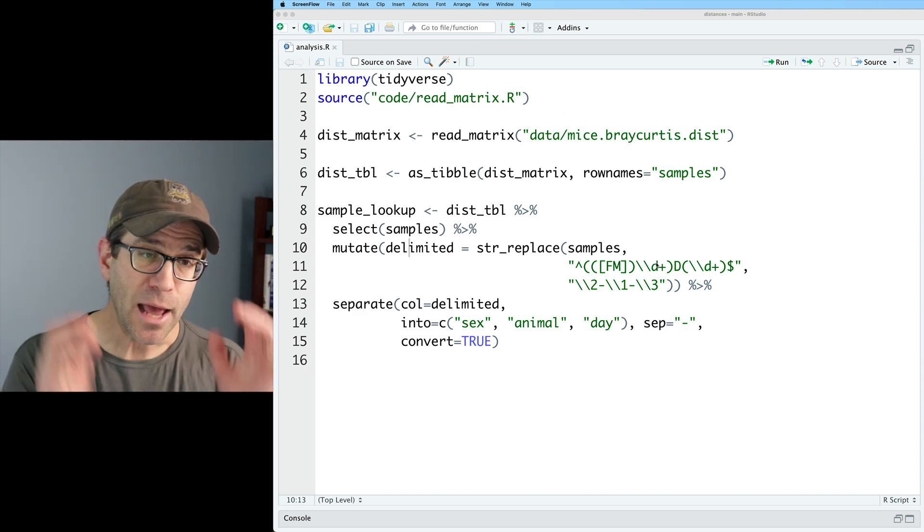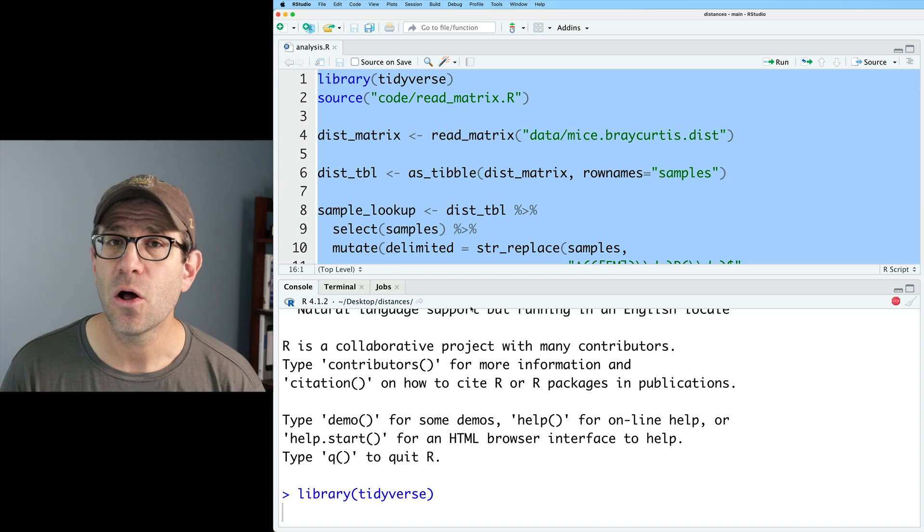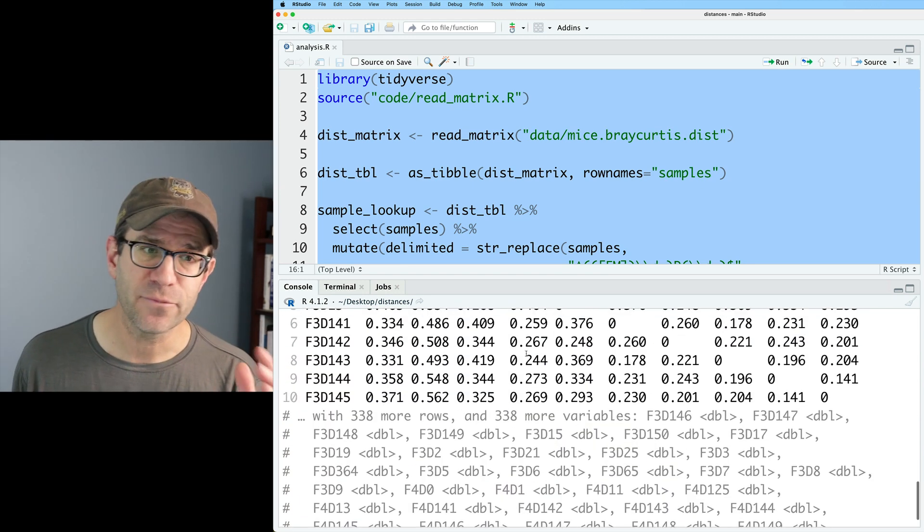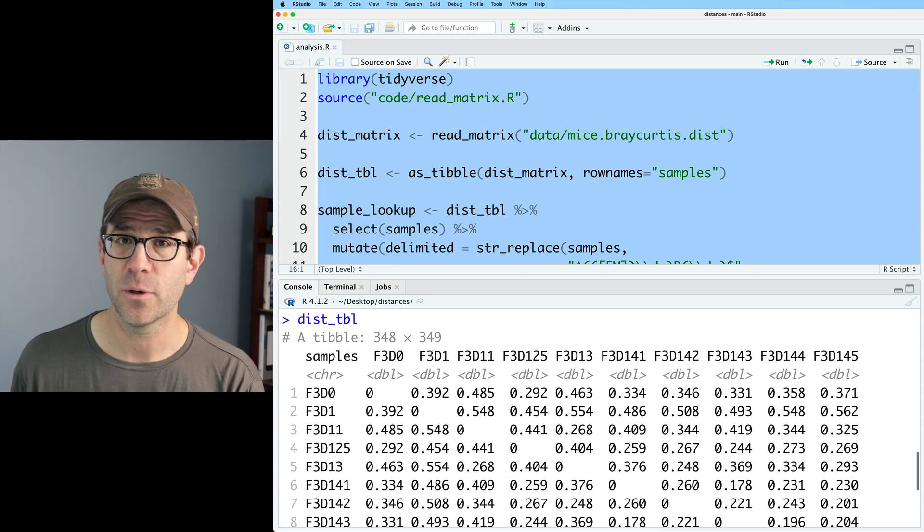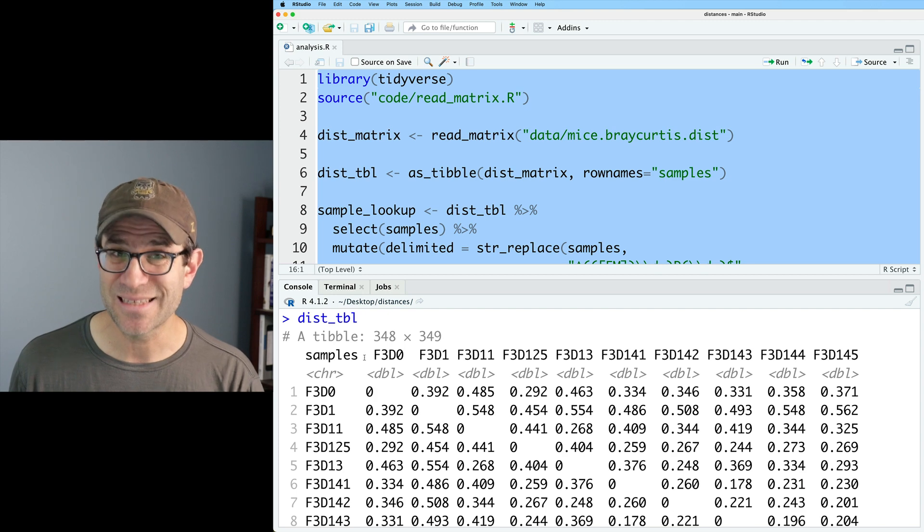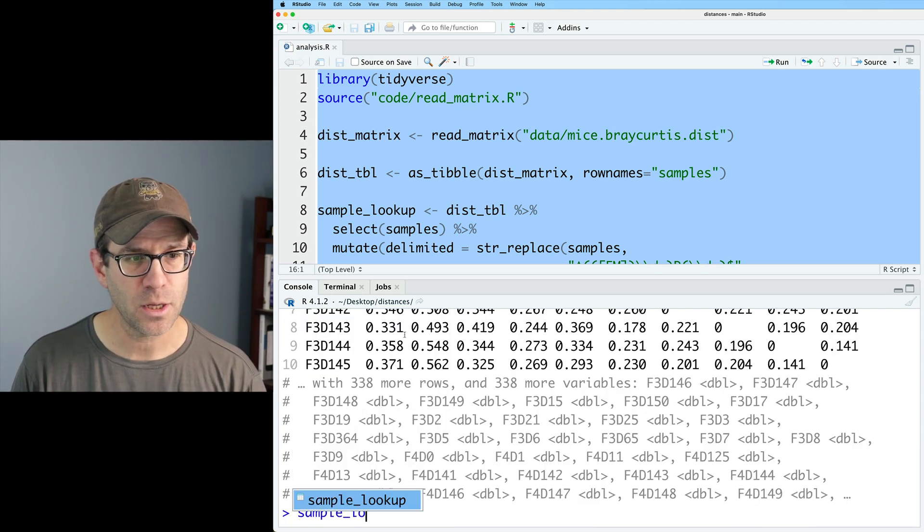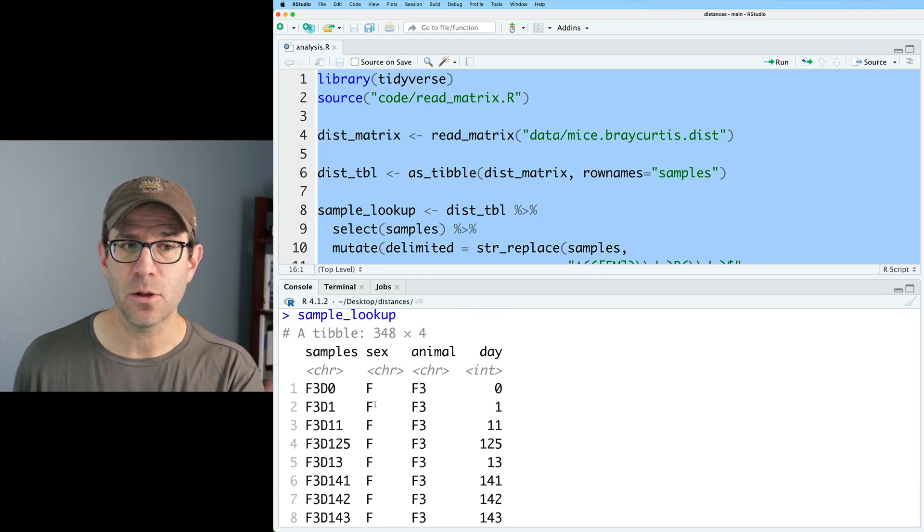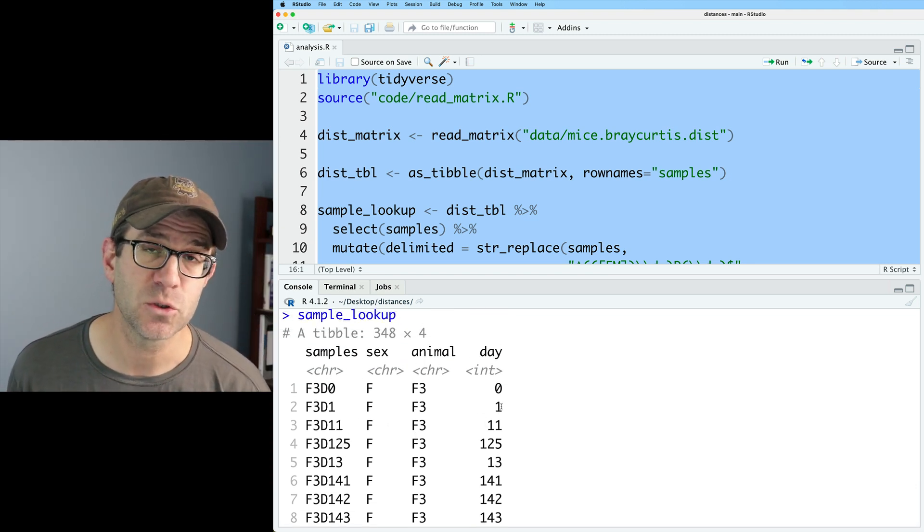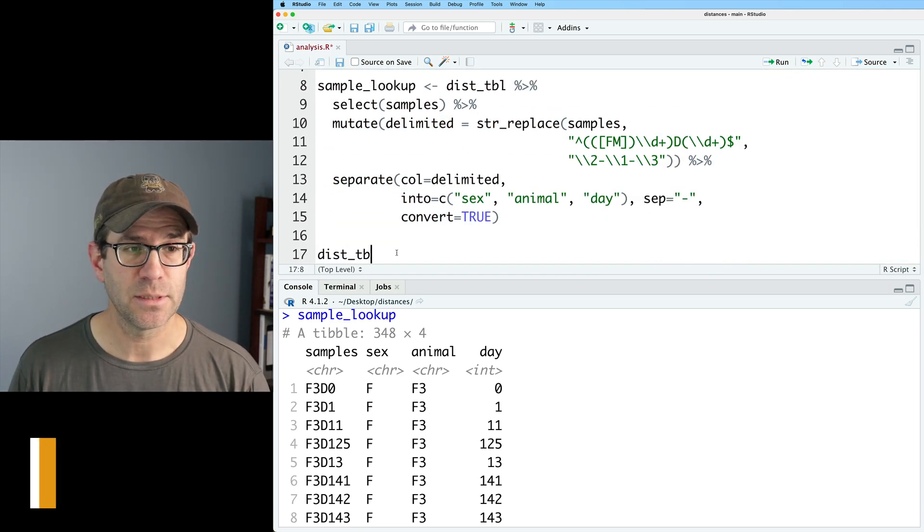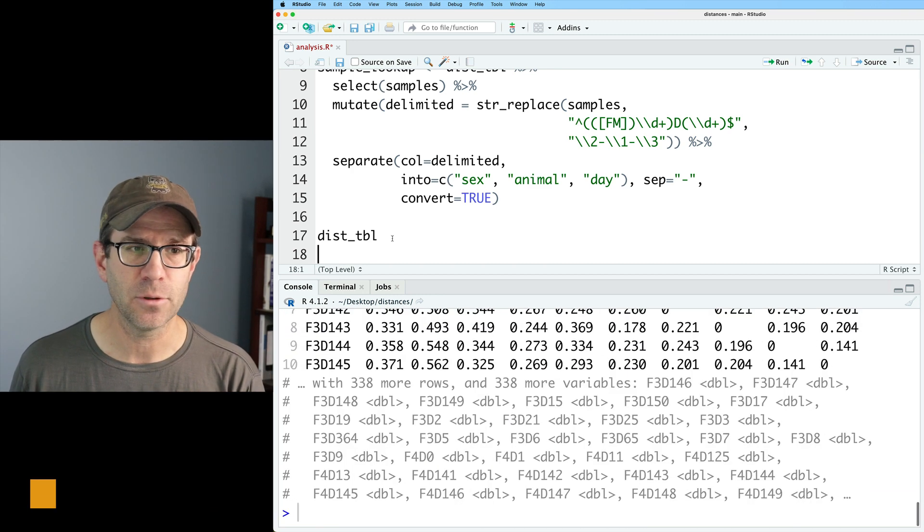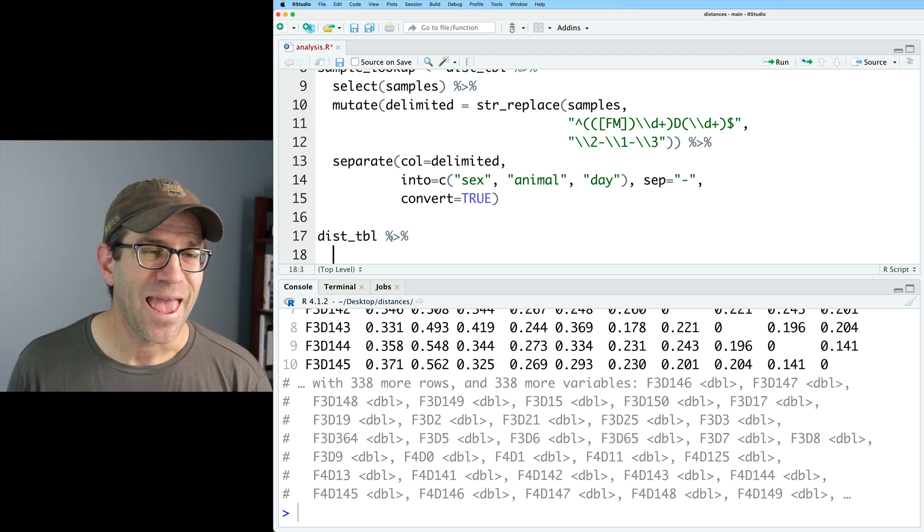So anyway, we have our R script here. I'll go ahead and run this and load all the code. So this will generate dist_tbl, which is a tibble form or data frame form of my distance matrix, 348 rows by 349 columns. It's got that extra column because it has that samples column. And if we do sample_lookup, we will then get a data frame that has the sample name along with the sex, the animal ID, and the number of days post weaning that the sample was collected from. So let's get started with this tbl. This is that 348 by 349 tbl. It's a special data frame in R that lives within the tidyverse.